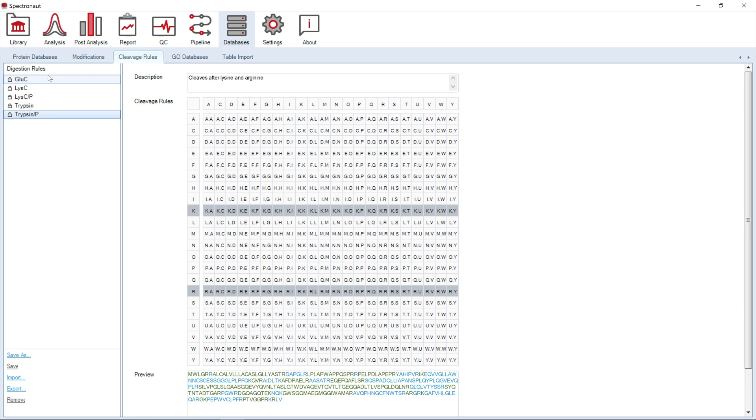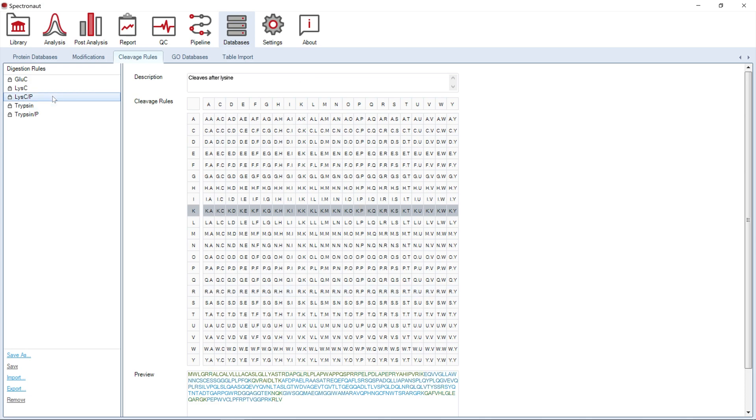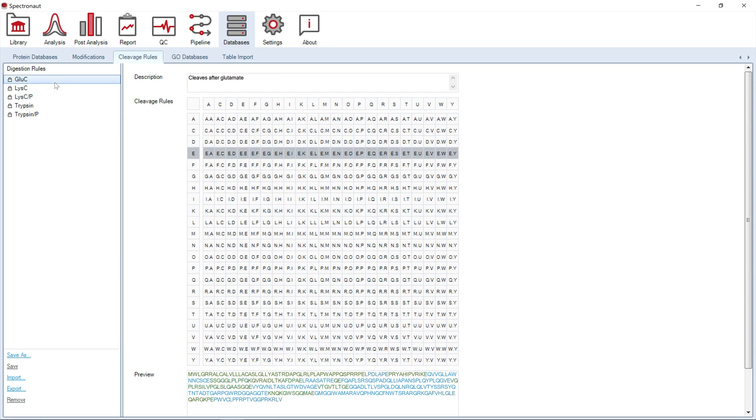Those digestion rules will be used to in silico digest your proteins from the protein database used in each experiment, either during library generation or direct DIA workflows. Using options in the bottom left corner, you can also specify your new digestion rule.